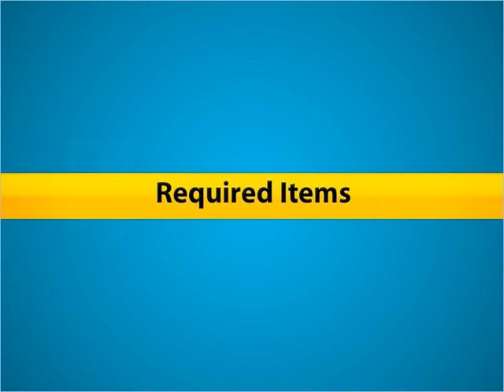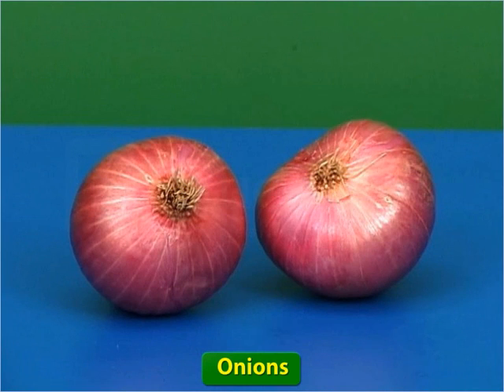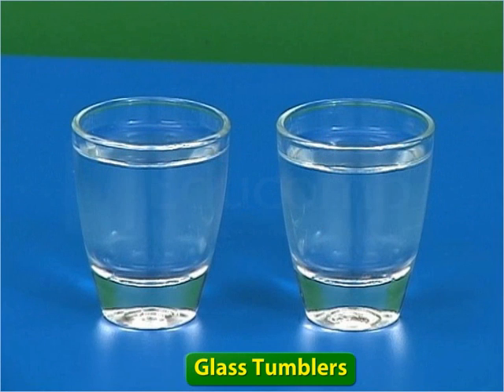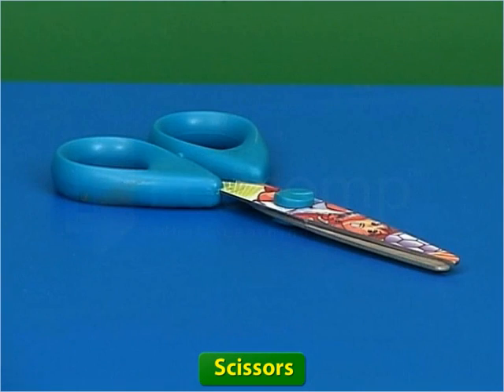To study the growth in the root tip of the onion, you need two same-sized onion bulbs, two glass tumblers filled with water, and a pair of scissors.